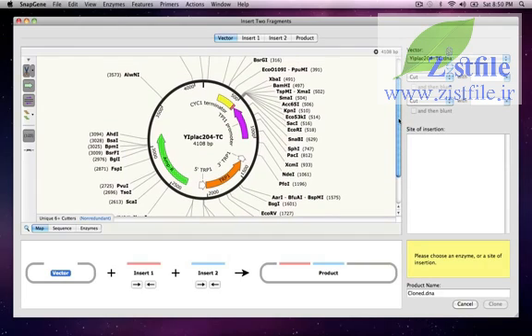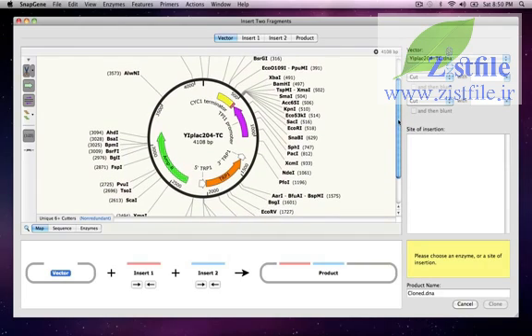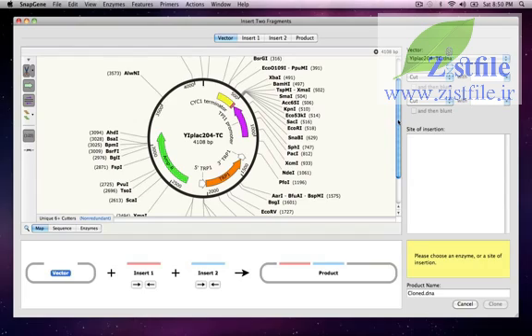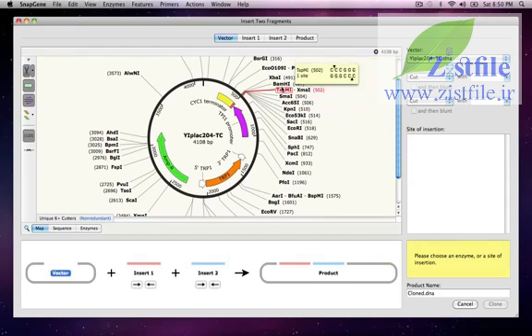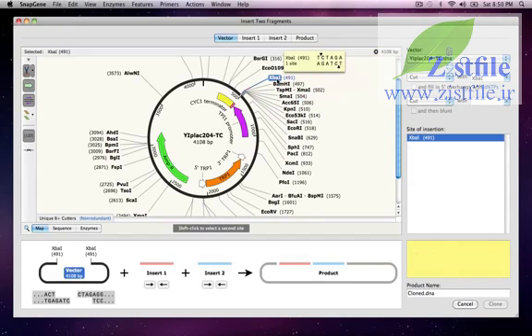which is a yeast plasmid that contains a multi-cloning site here in pink between a promoter and a transcription terminator. I want to insert the entire SEC7 gene followed by the EGFP gene. Both genes will be in the reverse orientation because the promoter is on the bottom strand. The cloning will be between the XBAR1 and KPN1 sites in the vector, so I'll click on XBAR1, then shift-click to select KPN1.